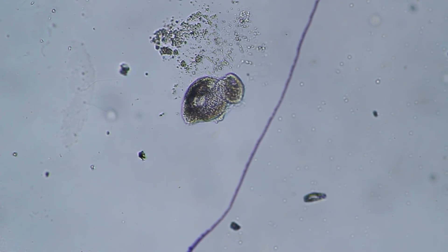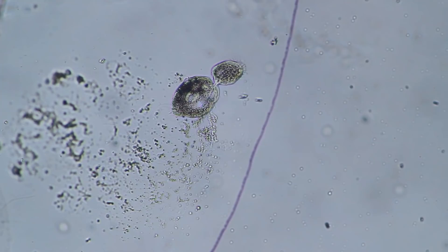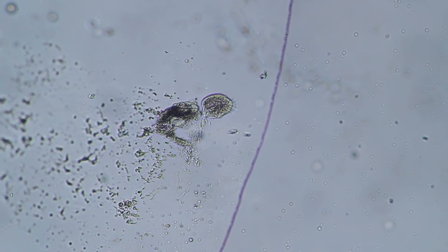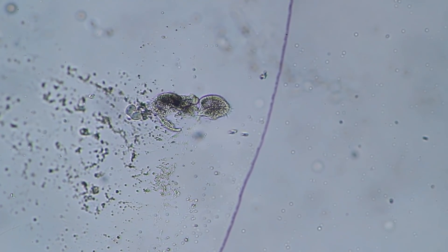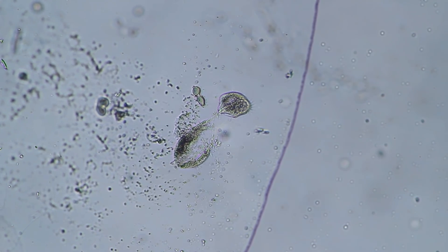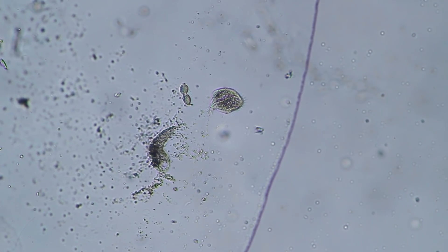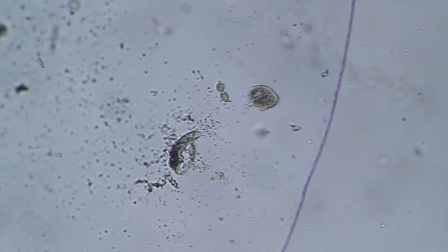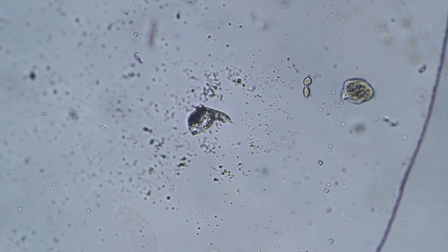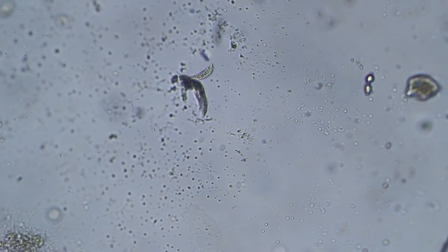And then I saw another one — another cell — and this one also broke open. Can you believe it? This one is really spilling its cell contents all over the place. All of those little dots that you see are all cell organelles. You see basically a cell disintegrating and falling apart right in front of your eyes. And the cilia, if you look carefully, they are also still moving a little — basically now distributing all of the cell's contents. The remaining cell membrane and parts of the cell haven't even noticed that the cell doesn't exist anymore — they continue to beat and move everything away.